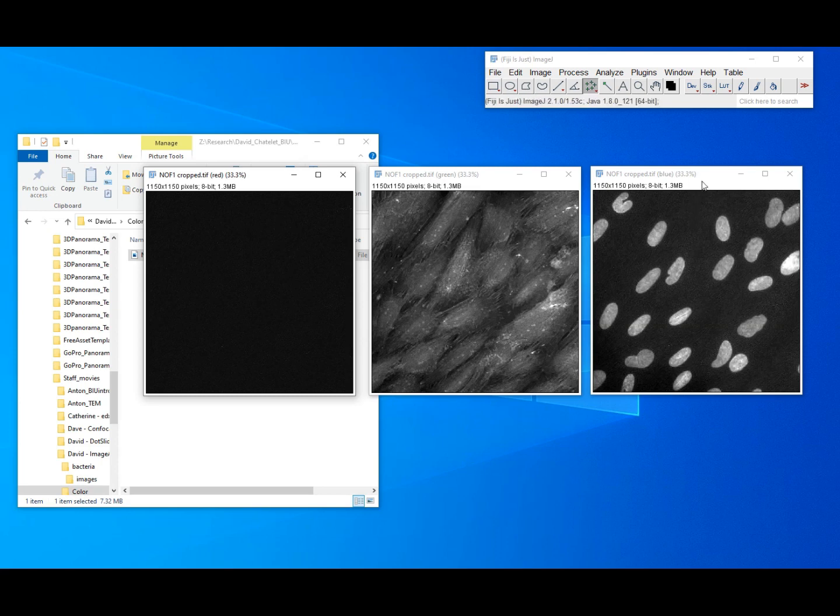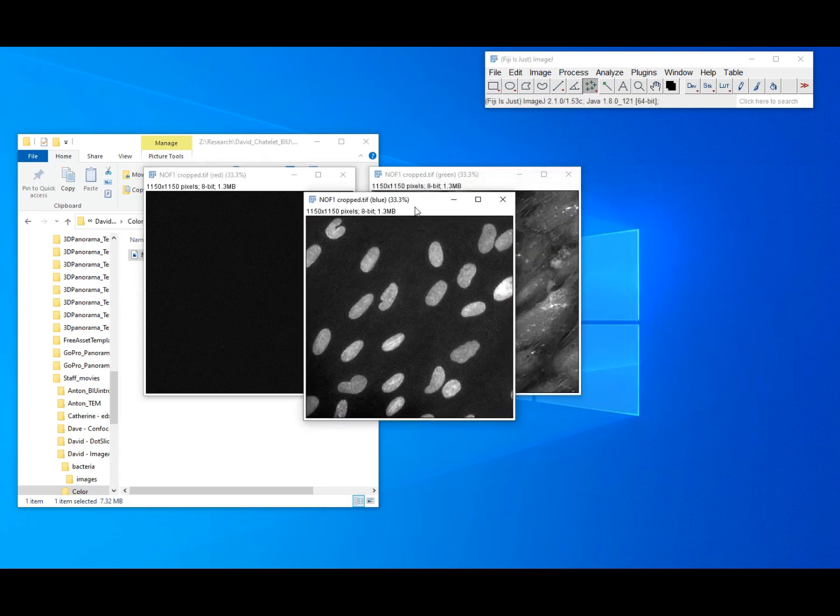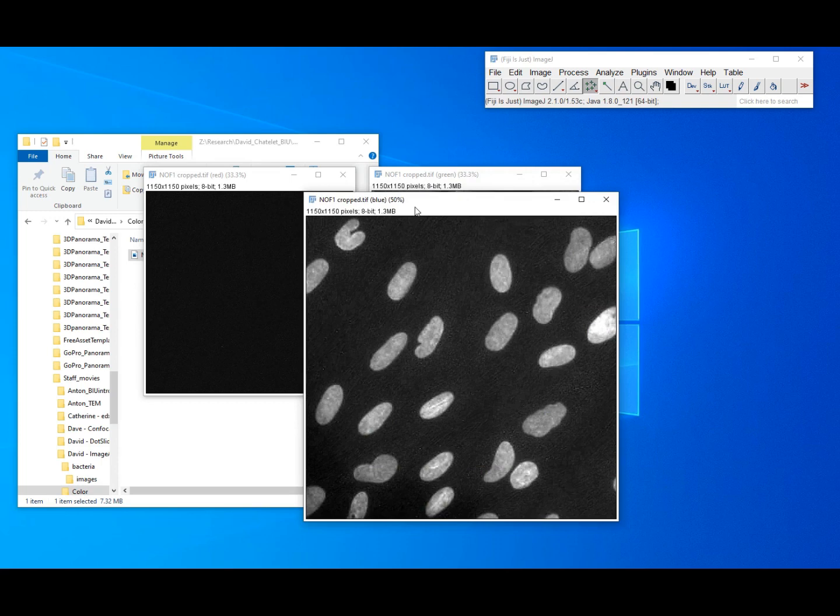Now, if that's what we wanted, we could count and measure the area of the nucleus in the blue image the same way we did it for the bacteria, and even write a script that would do the work for us. This was a very quick snapshot about 2D image analysis. Much more complex analysis can be done, but there was no time to go into that because I wanted to show you some 3D examples as well.